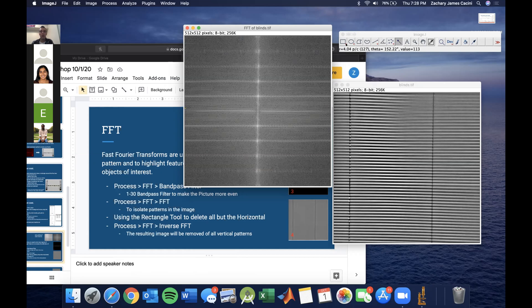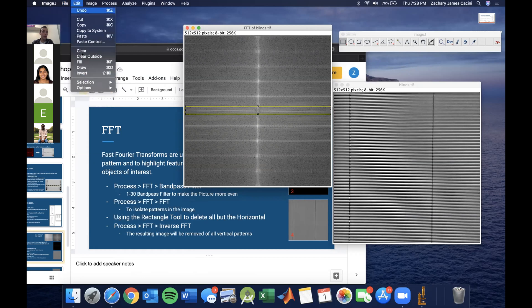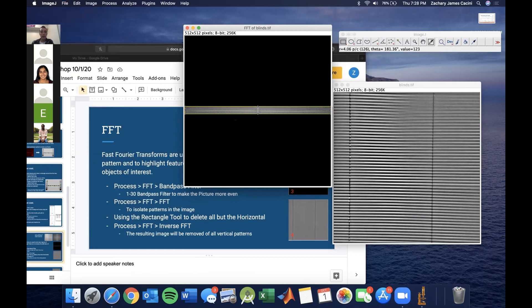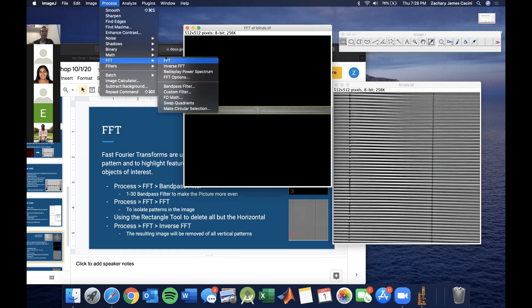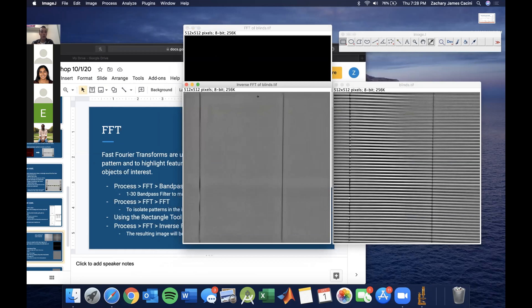Use your rectangular selector — I forgot to do my rectangle. You choose the horizontal portion, then go to Edit > Clear Outside. Then we're going to do an inverse FFT to subtract all the horizontal pattern. As you can see here, this image now only has the vertical patterns of these two lines.